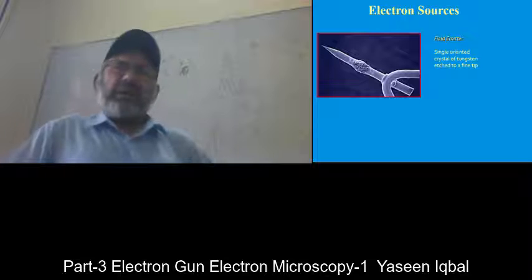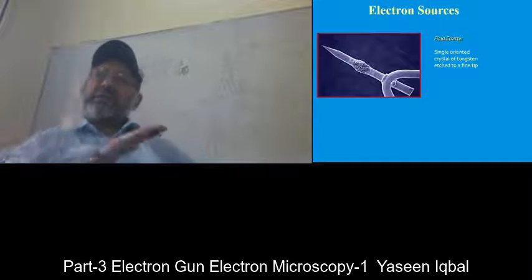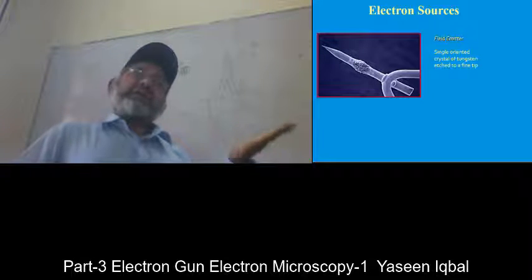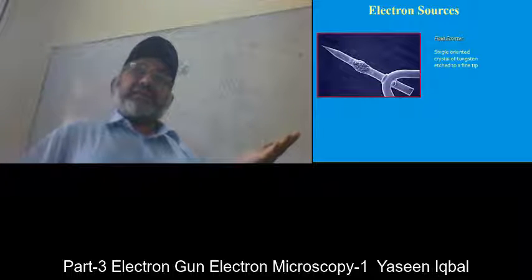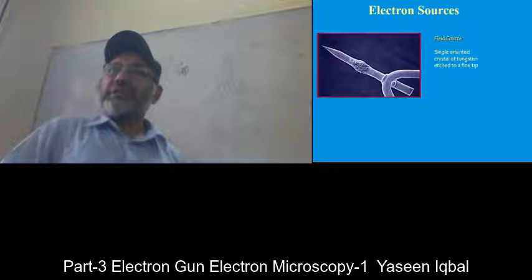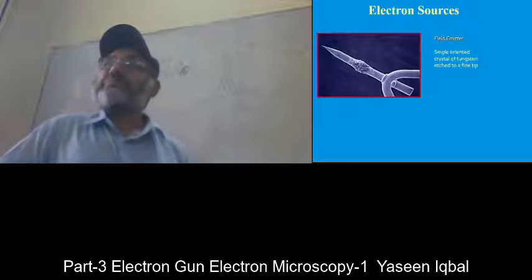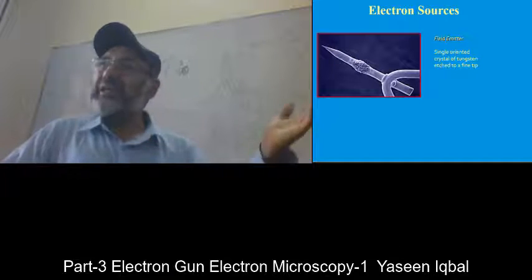People do it. The three types of samples are prepared for microscopy: cross sections, where you cut the material and look into that cut surface so you can see what is in between and what the grains or crystals inside it are. Then the chemical etching, when the sample is a mixture of crystalline material and glassy material, usually. When I'm talking to you, I'm telling you the conventional things. Specifically, you may have many different things, but I am telling you the simplest ones.